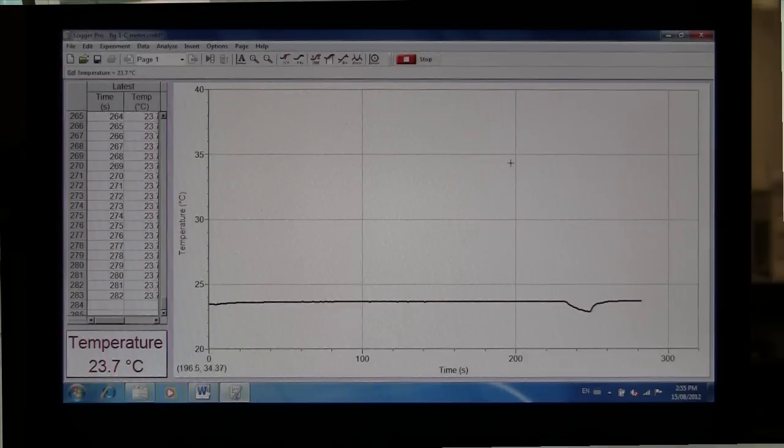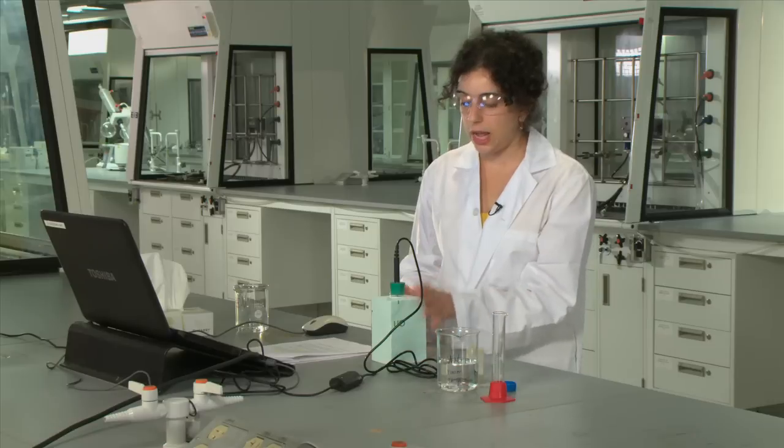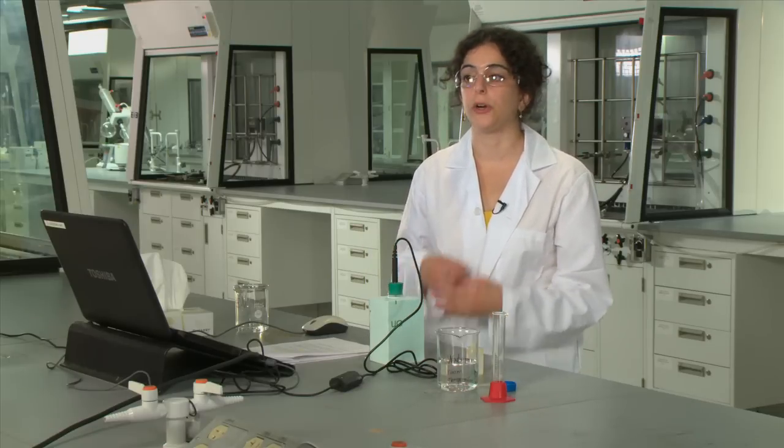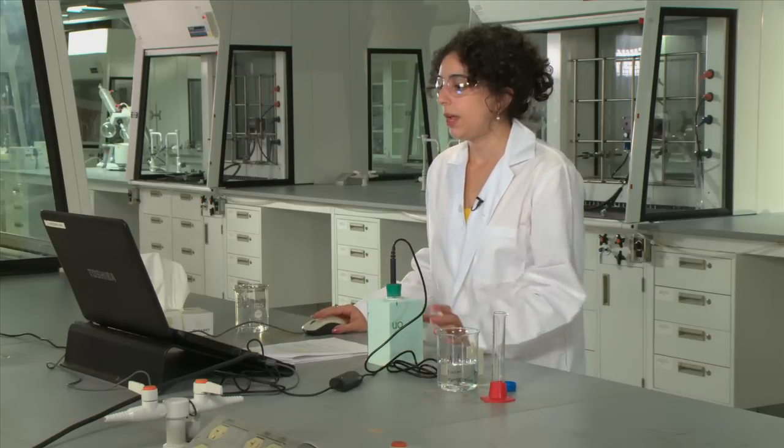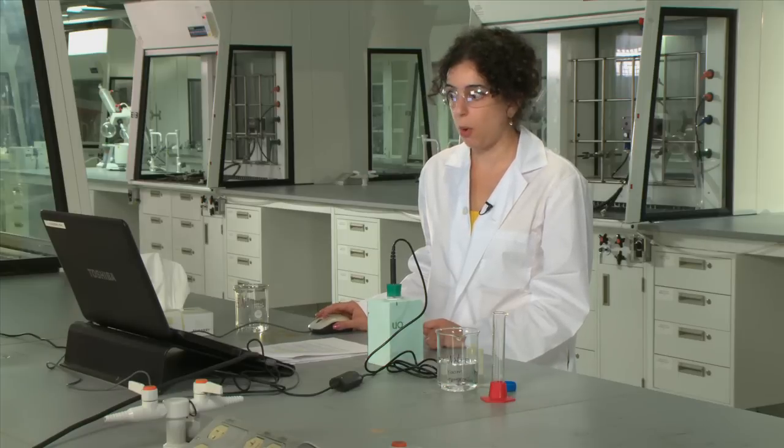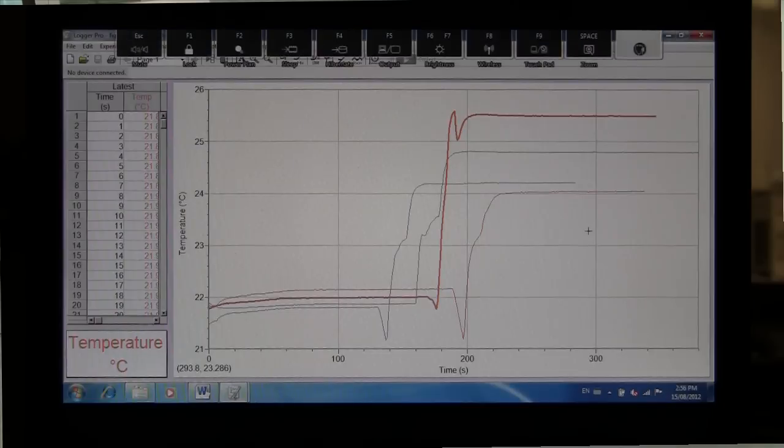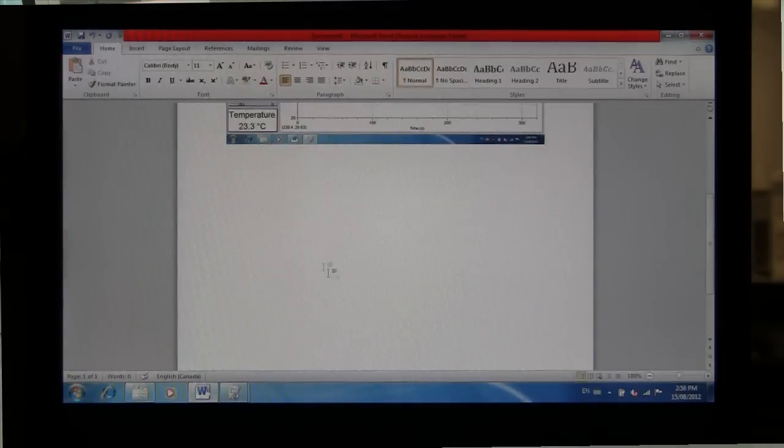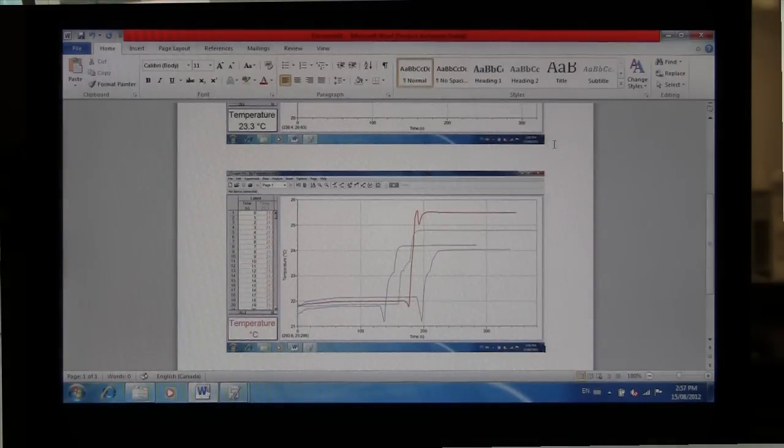You'll repeat this process for your other three masses making sure that in between that the calorimeter is cleaned out, so rinsing it out with some room temperature water and wiping it with a tissue. Once you've done all four of your trials you will get a graph that looks something like this. This is for one of the two salts that you'll be experimenting with and you'll see again that there's sort of two prominent plateaus in the graph corresponding to the initial temperature of the water, a spike when the salt was added, followed by a final temperature of the mixture. Once you have collected these four points you'll print screen the graph as usual and paste it in your word file and make sure that it's saved.